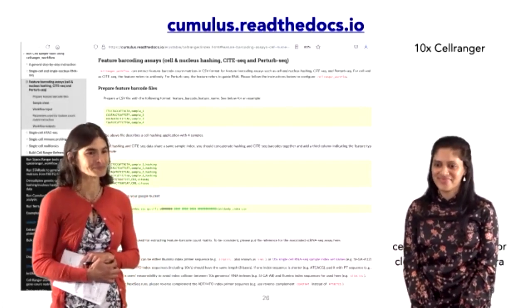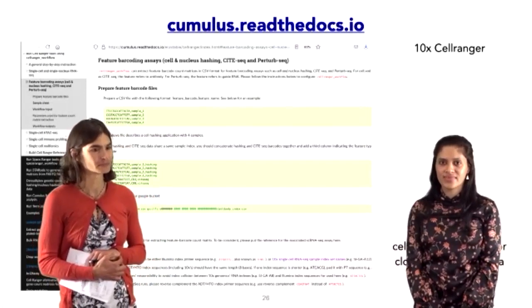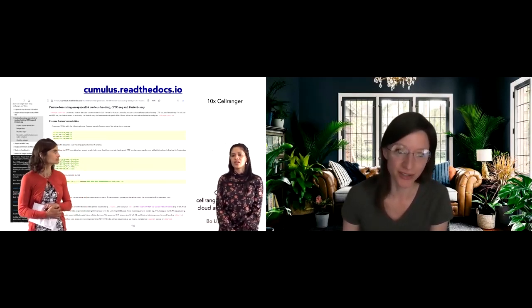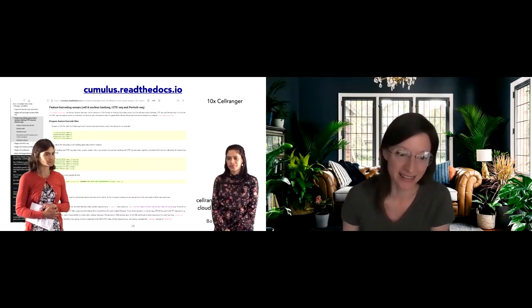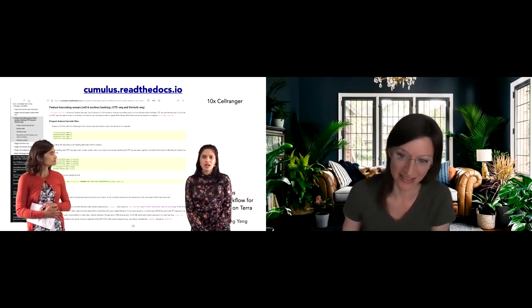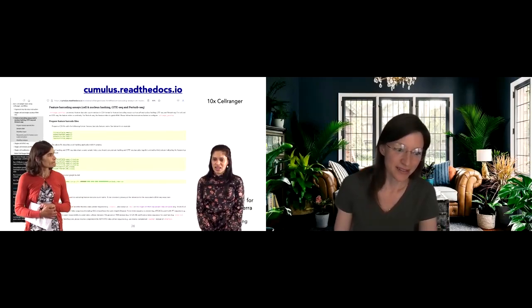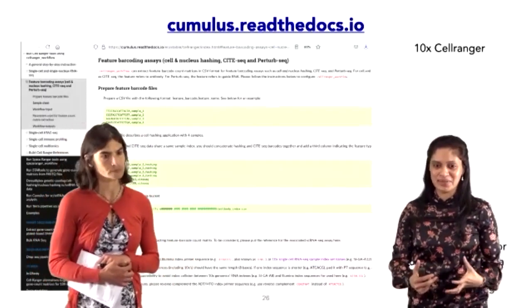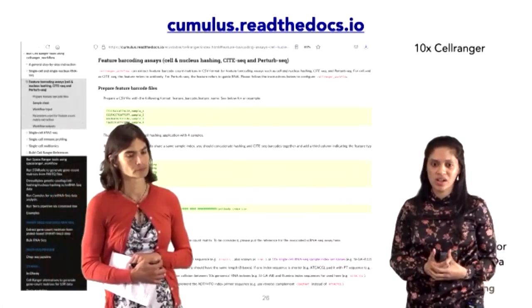Thank you. One of the questions I had was just regarding cell type for Perturb-seq and whether you've observed that certain cell types are more amenable to the process or others have been more difficult to model due to logistical or just heterogeneity in the actual cell populations. So that's an excellent question. Again, maybe more for an experimentalist who actually handles the different cell types and who might be optimizing the protocols.